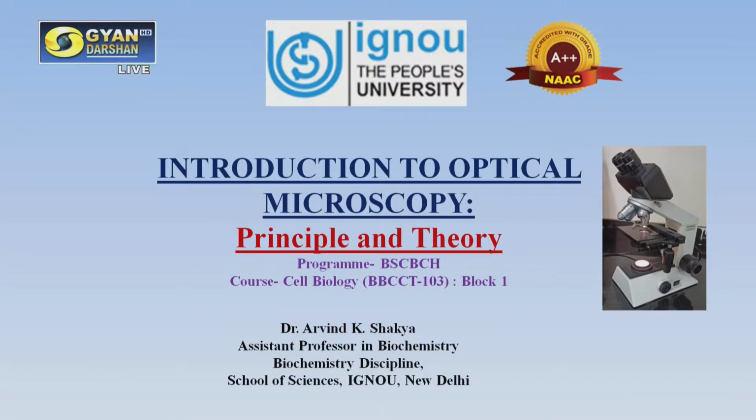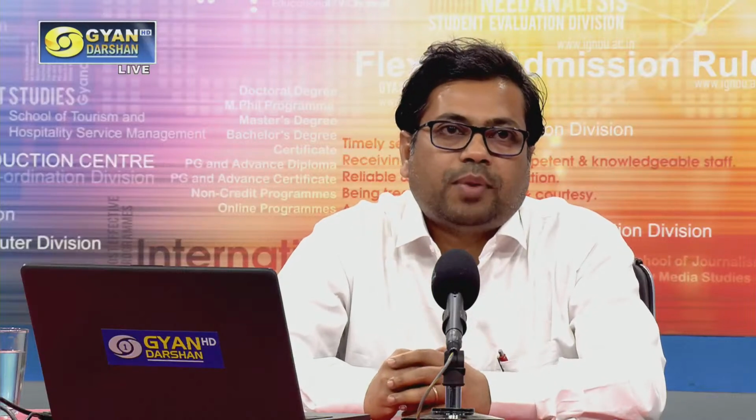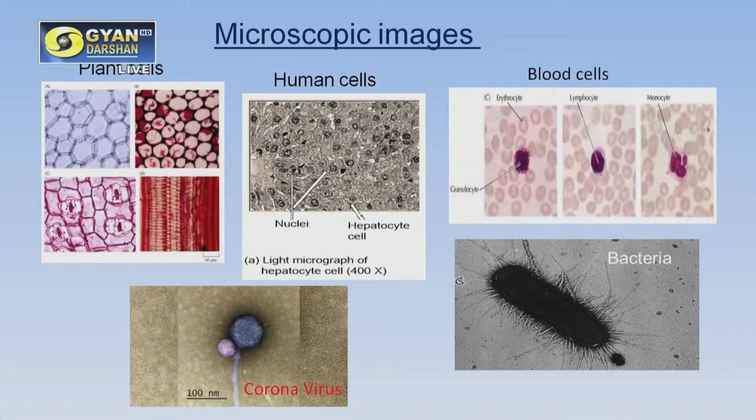In today's session I will focus on the different kinds of optical microscope and what the principle and application of the optical microscope are. Have you seen this slide, like microscopic images? Of course, you might have seen these different kinds of microscopic images under a microscope in your biology courses at undergraduate level and in the 10+2 biology laboratory. These are microscopic images captured by the microscope.